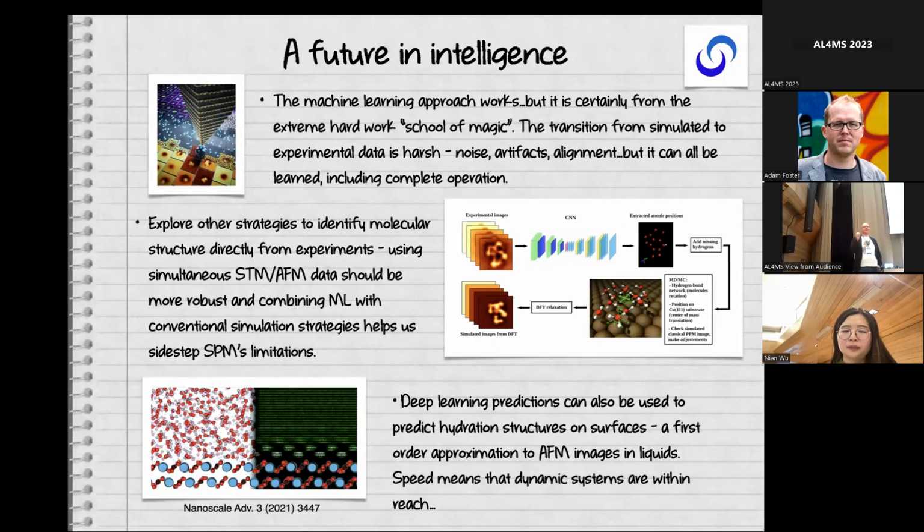And the other thing is that the tip changes. Okay, you have a silver tip and we've picked up 1 or 2 silver atoms, fine. If we're imaging a 2D material on a superconductor, there's all sorts of nasty stuff we can pick up, which is not going to be just making the tip, it's going to completely change it chemically. And this is going to be a challenge.